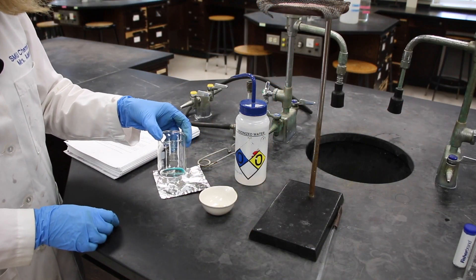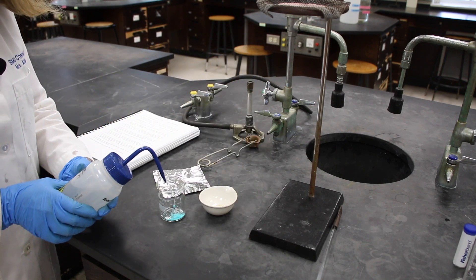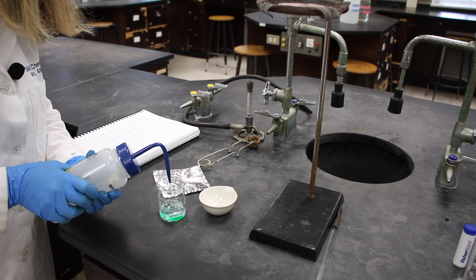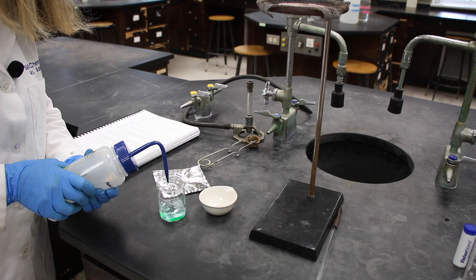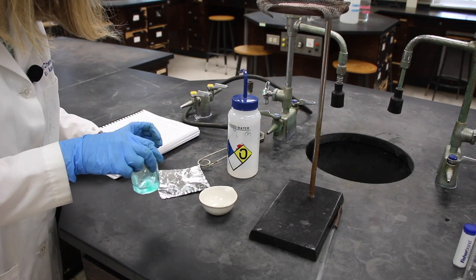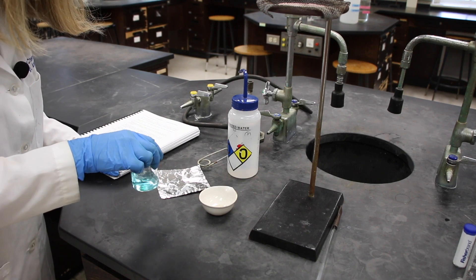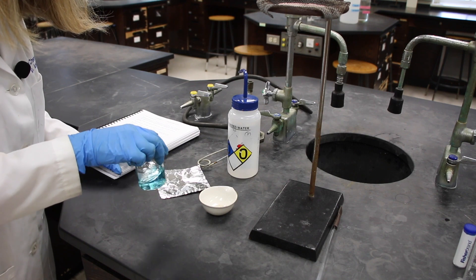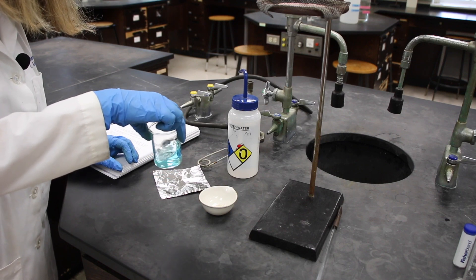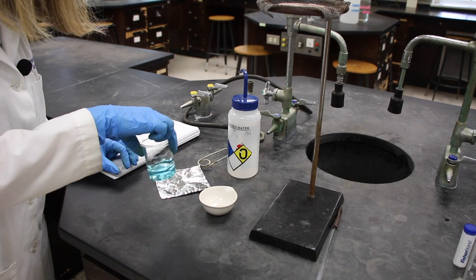Now that we have our copper chloride dihydrate in our beaker, step four says to add about 30 milliliters of DI water and kind of swirl to dissolve it all. It should dissolve very quickly. If there are any large chunks, you can break them up with your stirring rod. Everything just went into solution.